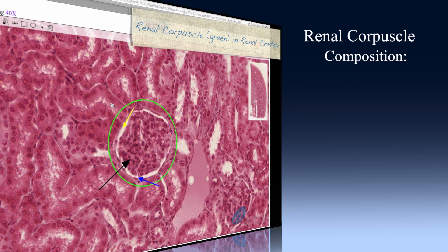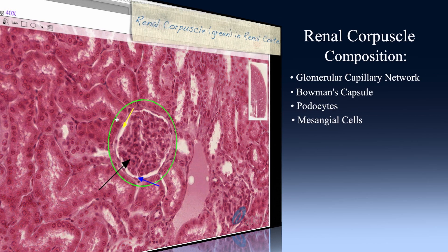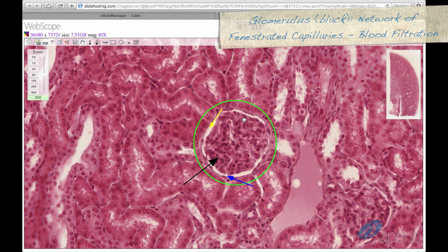The renal corpuscle is composed of the glomerular capillary network, Bowman's capsule, podocytes, and mesangial cells. The glomerulus, seen here at the black arrow, is a network of fenestrated capillaries which allows for filtration of blood.